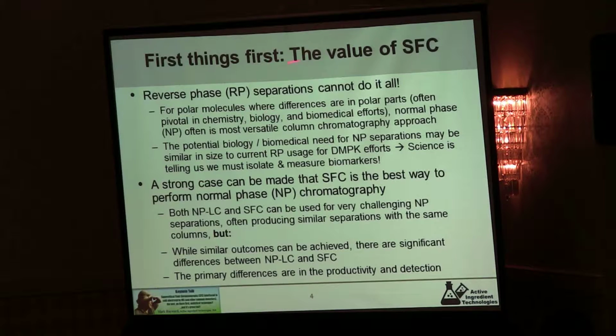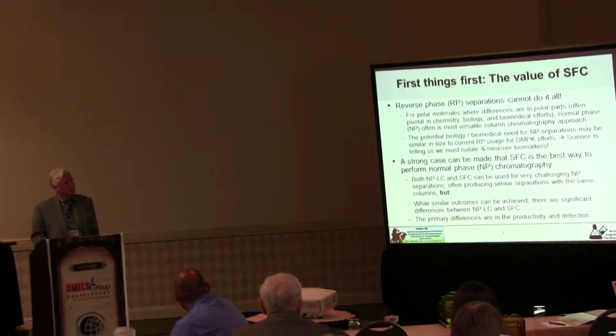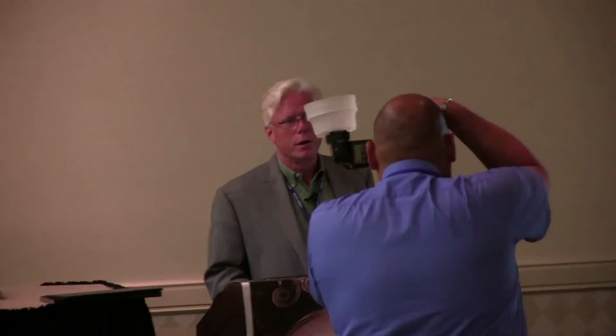Most people do reverse phase HPLC, by far the most common approach used, and certainly by us too. However, reverse phase is an excellent tool when you have a lot of grease on the molecule, or high logP, but once the molecule becomes fairly polar, it becomes increasingly challenging. And you often see methods out there that are really fighting to just barely be done with reverse phase HPLC. And ultimately, at some point, you have to turn to normal phase chromatography to do highly polar molecules that don't have much lipophilicity.